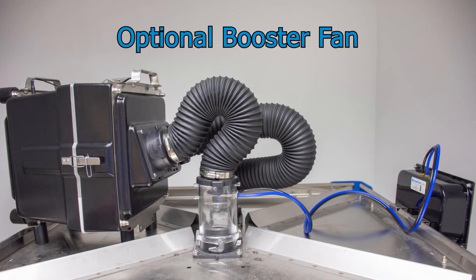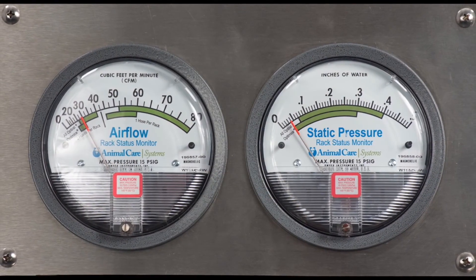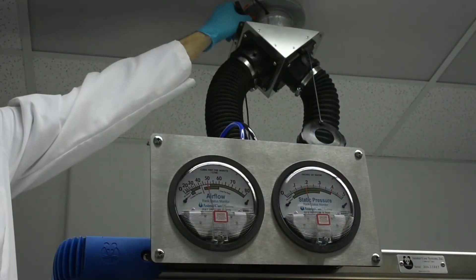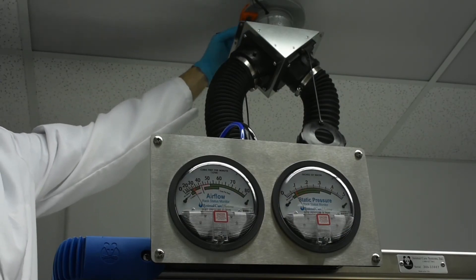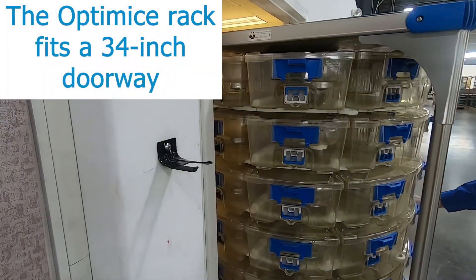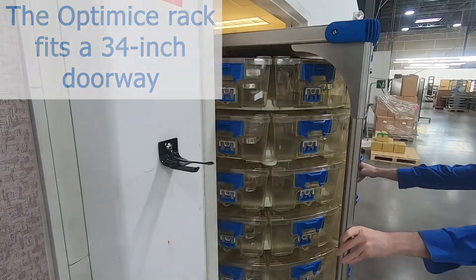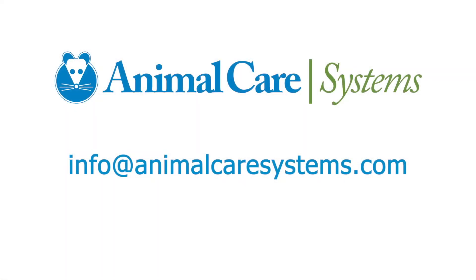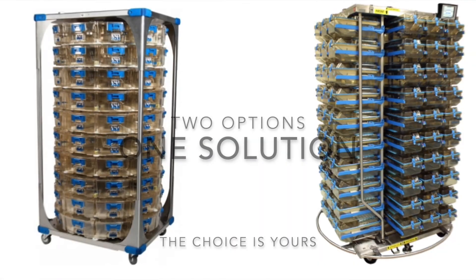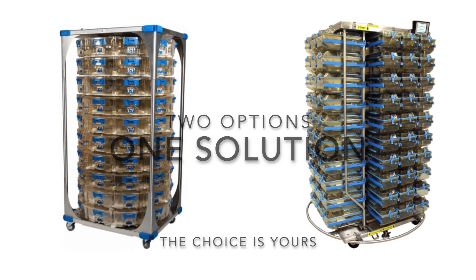Animal Care Systems offers booster fans for situations when increases to the housing room density have exceeded the exhaust capacity. The Optimize has an optional rack status monitor that provides real-time information on airflow and static pressure. The compact size of the Optimize rack allows it to go into smaller elevators and enter rooms with narrow doorways and short-swing clearances from the corridor.